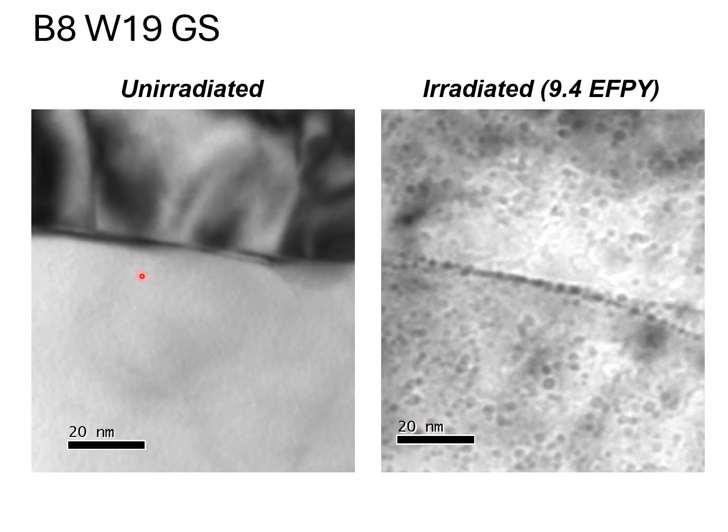So the reason I mentioned about having the microscope aligned is because when we first were having evidence that we're getting a lot of intergranular fracture in our spacer materials, Inconel X750, we had the benefit of seeing the earlier work in the mid 2000s from Edwards and Fujimoto of helium bubble segregation on boundaries.